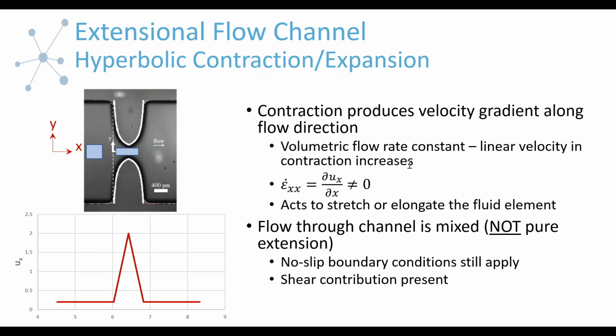So in that case, although the shear viscosity was low, the extensional viscosity was higher, and it seemed to resist the onset of turbulence. Even the onset of turbulence may not be a problem for you if, for example, your application is under flow conditions where that may happen, and you may want to see how that impacts the response of the fluid. That may be relevant for your application, the onset of turbulence or not. So that's not necessarily a problem.